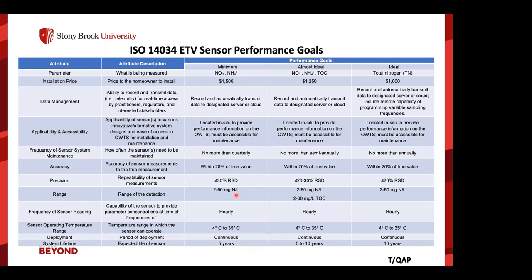The sensor can run between 4 degrees and 35 degrees. And they set the frequency here as hourly. They made it more difficult. That means the measurement can be hourly, daily, or weekly. That means the sensor can change to any schedule based on the parameters of a customer.